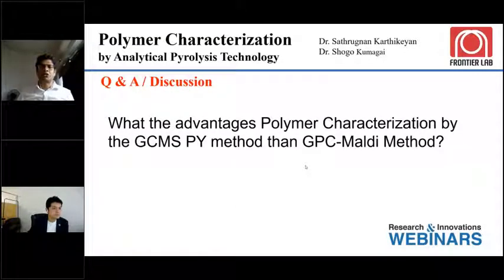Dr. Shogo, if you want to add anything, please. Yeah, Py-GCMS is the simple way, and I believe that Py-GC is more excellent for characterizing the microstructure of the polymer than the GPC MALDI method. So Py-GC is more simple. GPC may be for the macrostructure. Okay. Next one, please.